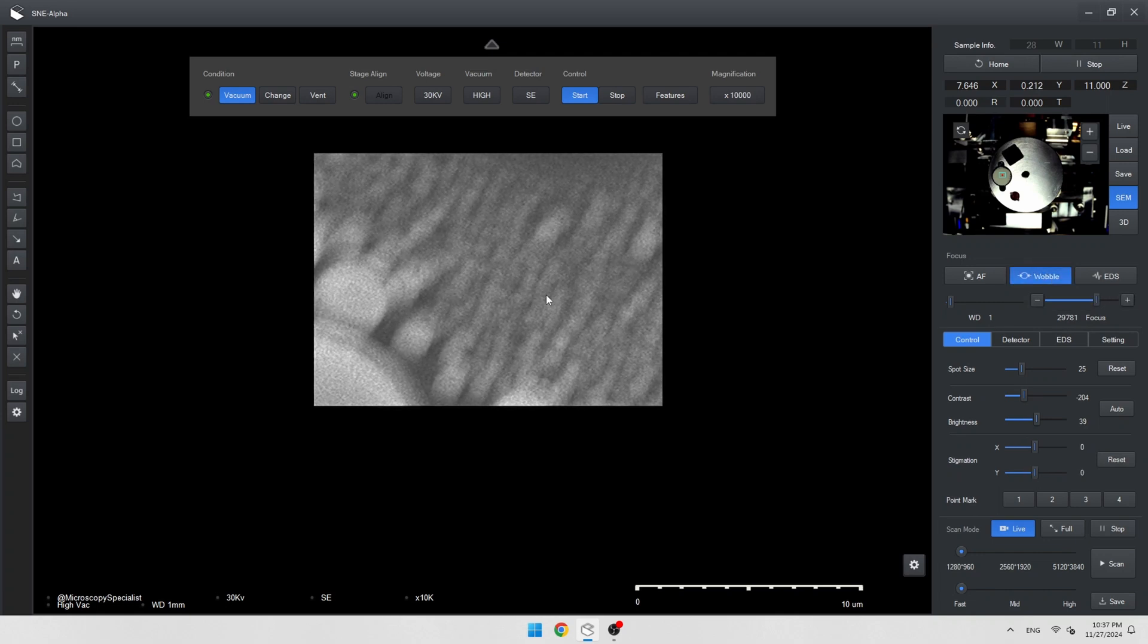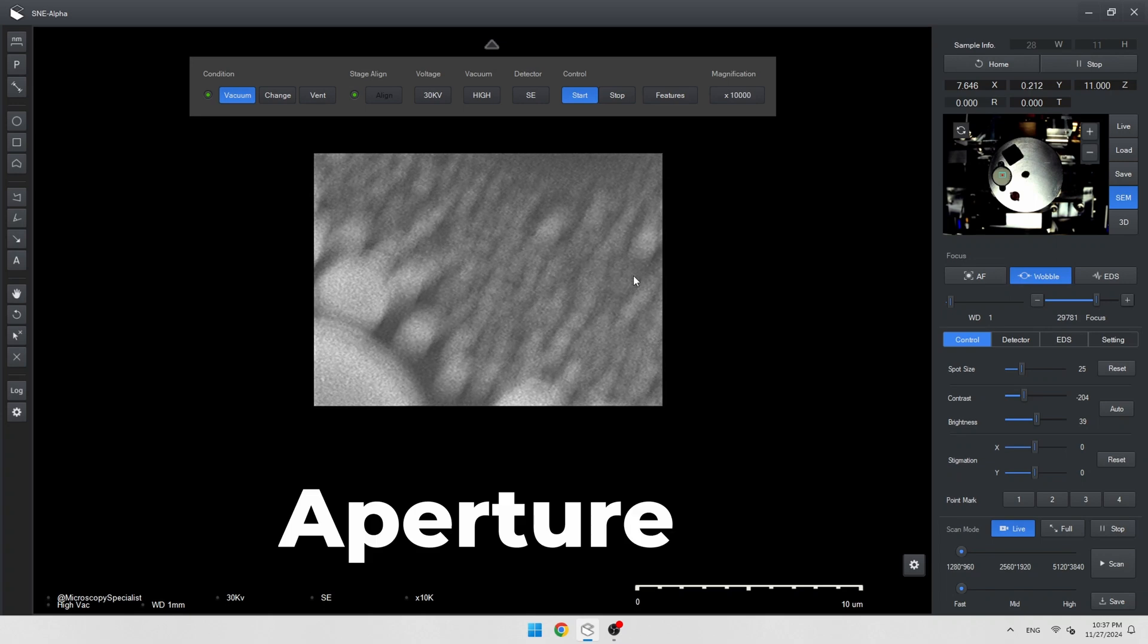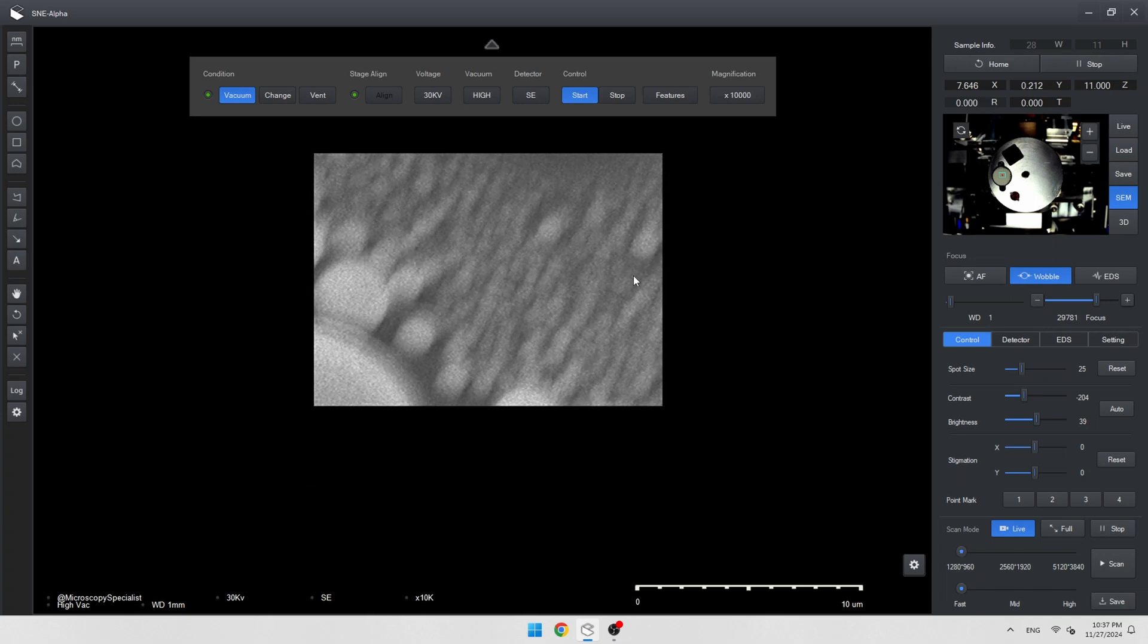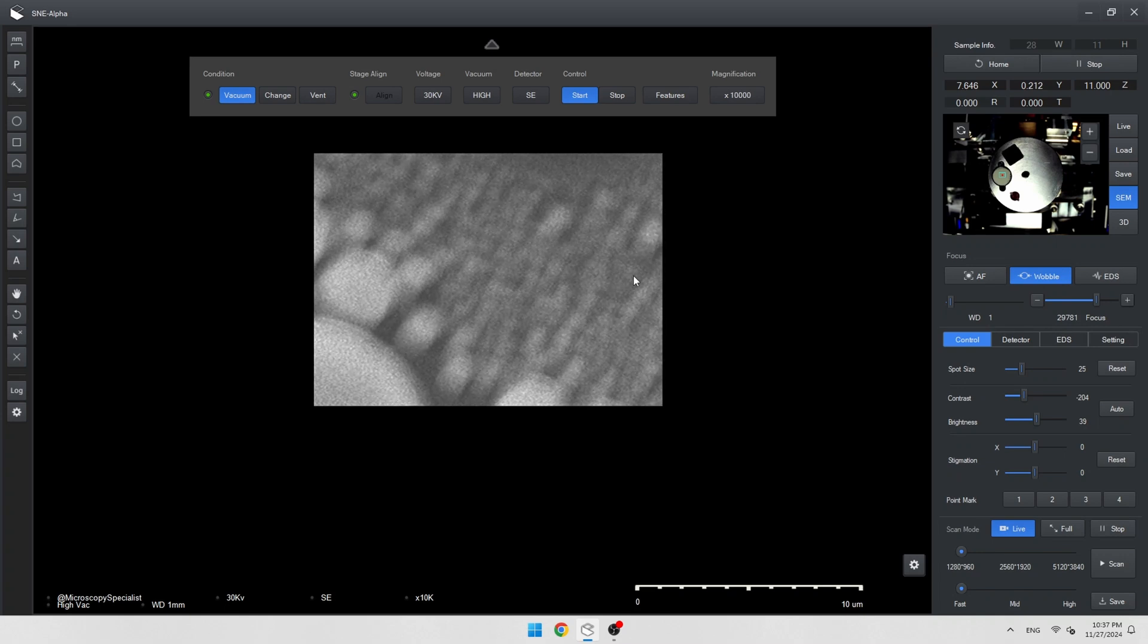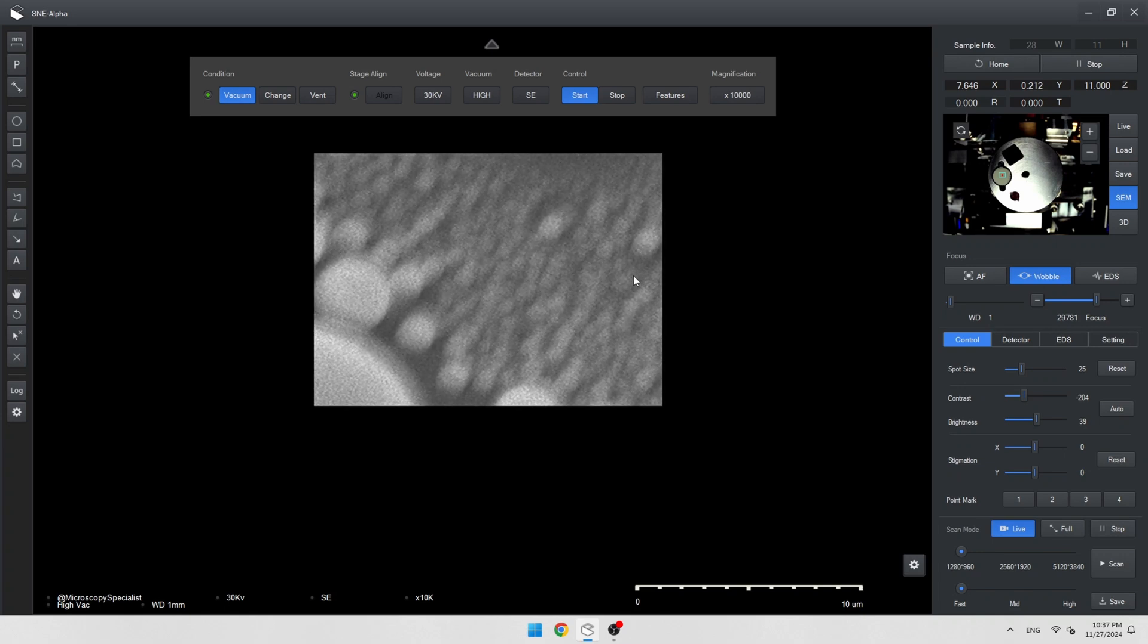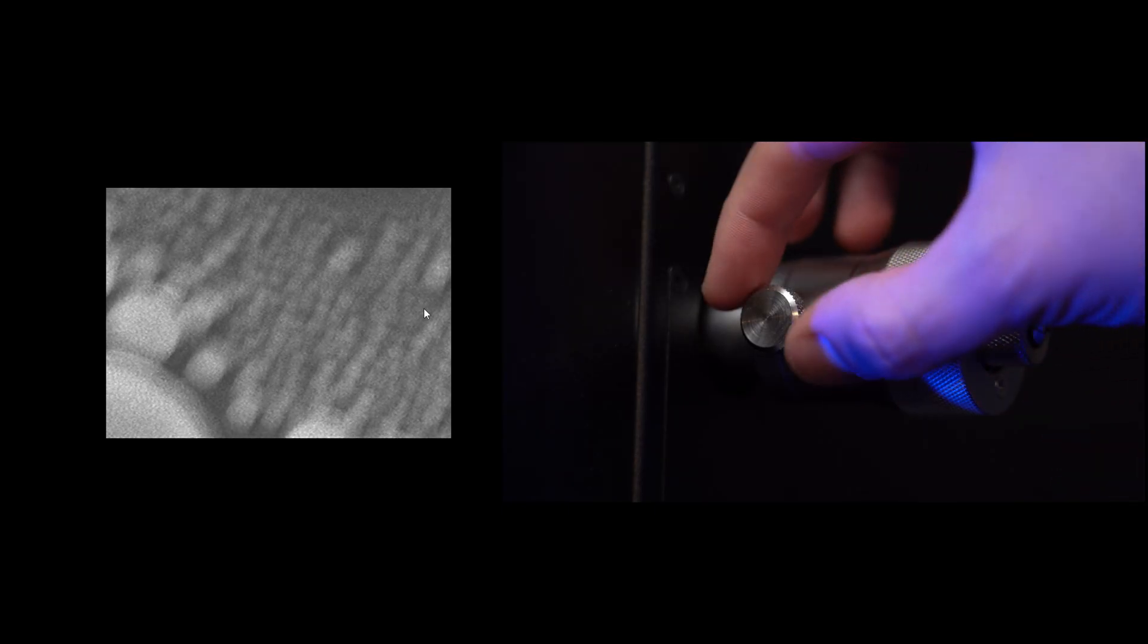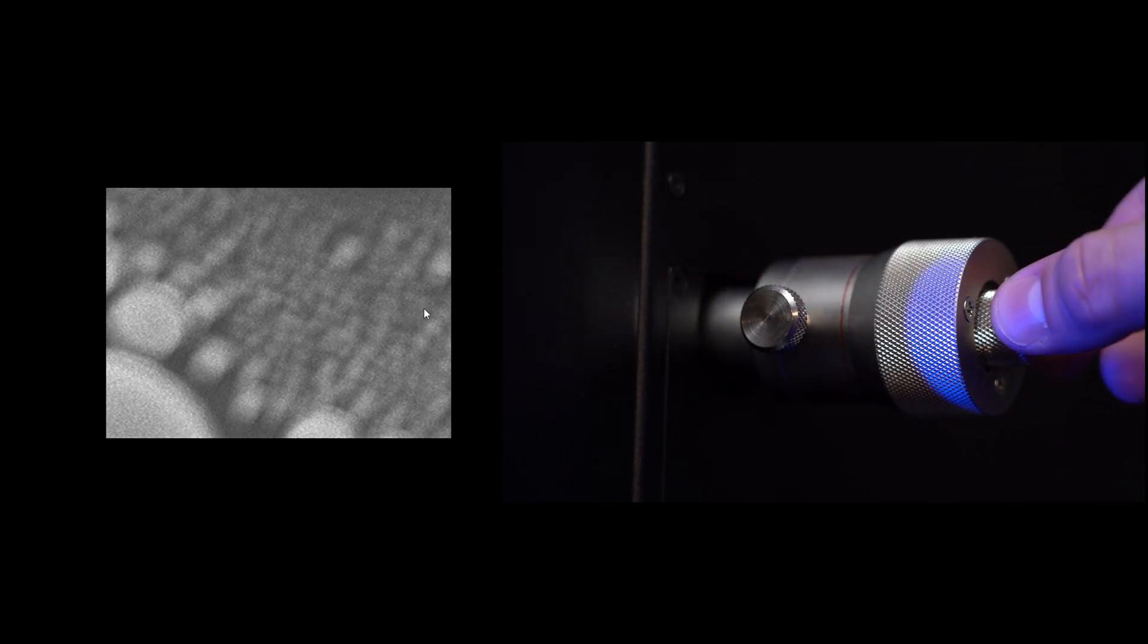Now we should adjust aperture and stigmation. First is the aperture. Click the wobble button. The microscope changes focus up and down and we see the sample shift. This indicates that the beam is not perpendicular to the surface of the sample.